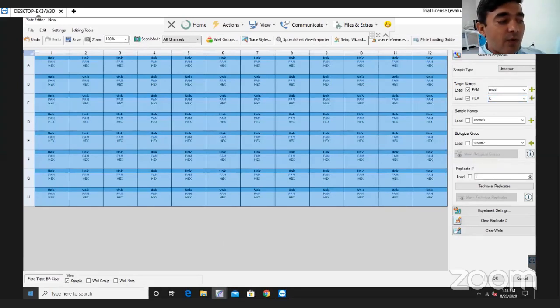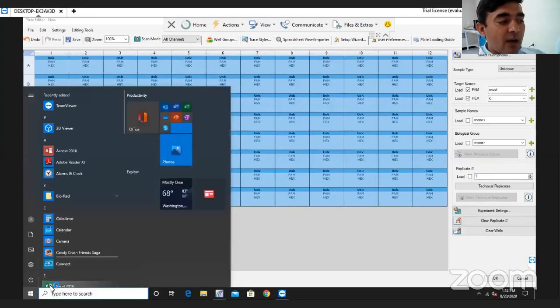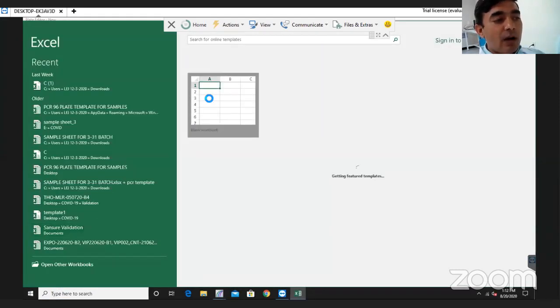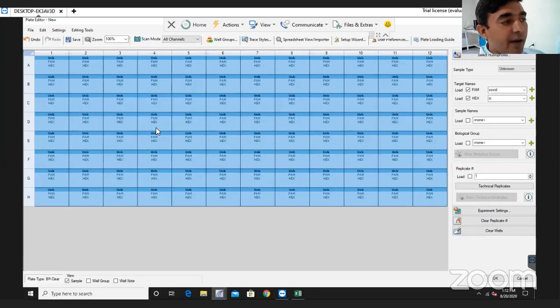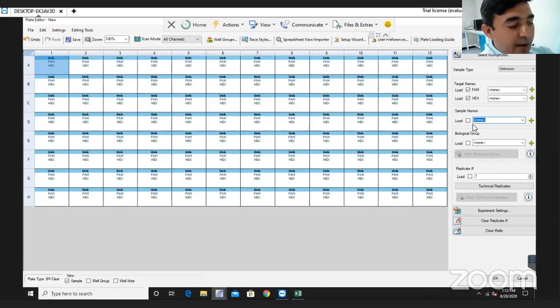So for this labeling process, we can go with two different approaches. Either I label this sample in this particular well with whatever code we give and select the sample, so the sample is labeled here, or through a one-by-one process we can label this whole plate, or we can use a barcode scanner as an alternative. We put the cursor over here and scan the whole barcodes from the system.